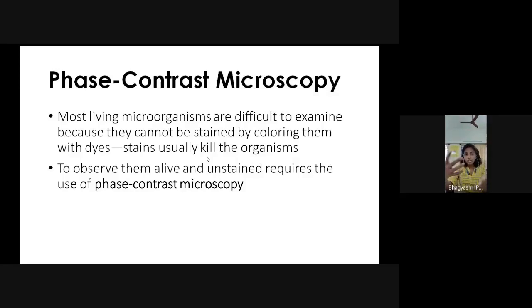And the procedure is such that you want to make a smear on the slide, right? So you want to put that bacterial culture in a liquid state, mix it with the dye, and with the help of another slide make a smear.